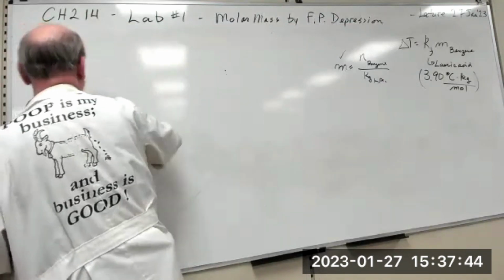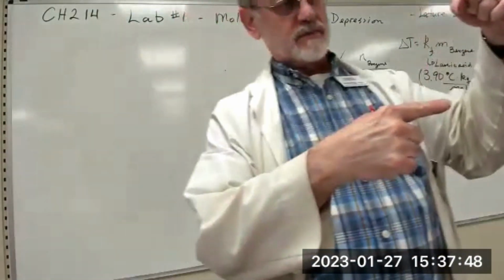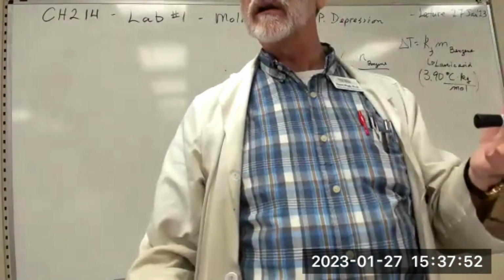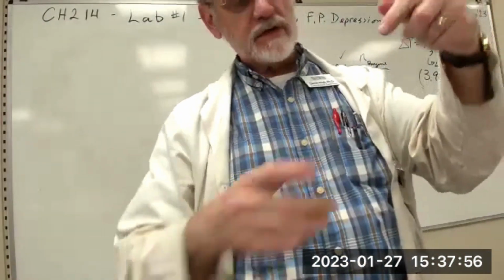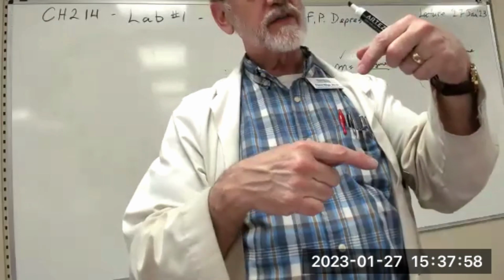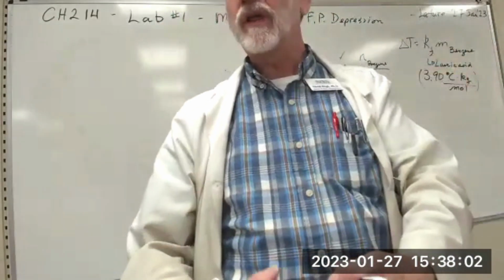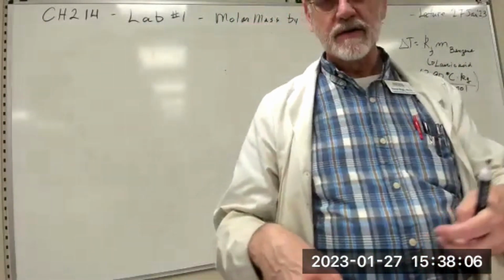There are some other things that we're going to need. Like we need big tubes, about that big and about that big around. We need a funnel, because you want to add the material to the tube in such a way that it doesn't get stuck around the top, because you want it to be down where the boiling water is. And you'll have a thermometer stuck in there.